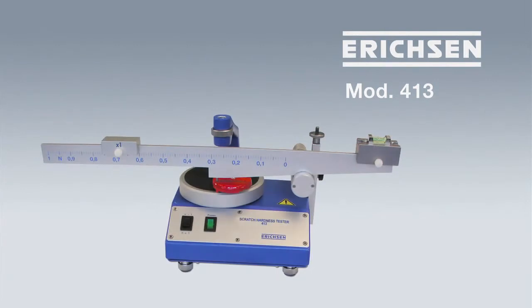Due to its very finely adjustable scratch force, the user is able to realize even slight differences and tendencies.